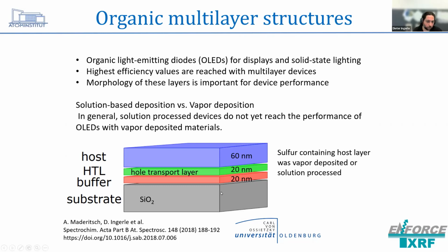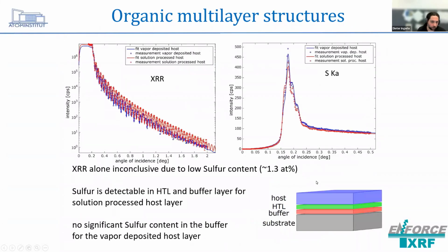In this case, the main topic of investigation was a 3-layer stack with the host layer here, which is called the host layer. It's just some sulfur-containing organic layer. And this was then prepared differently: one by vapor deposition, one solution processed, and then we did the analysis.